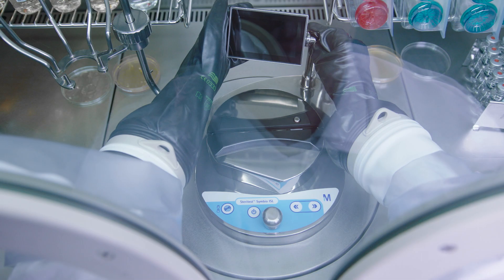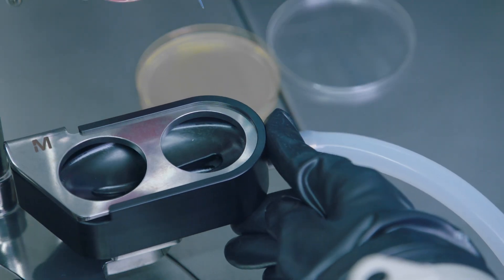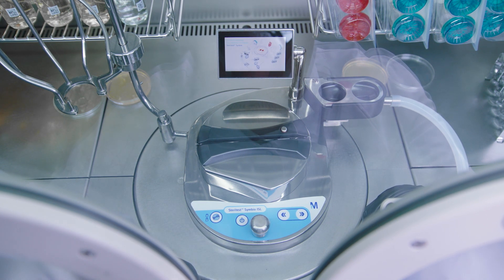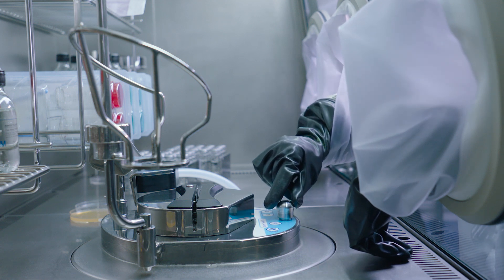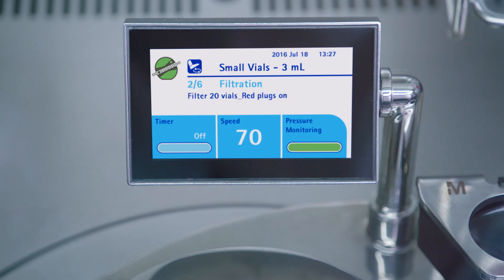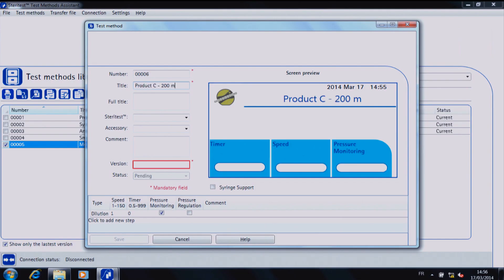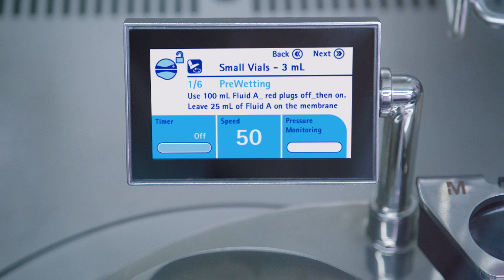The Steritest pump head cover, drain tray, and bottle holder are installed. The Steritest Symbio pump is designed to maximize safety and confidence while streamlining workflow. Its compact design preserves loading volume and testing space in the isolator. The pump's test method mode ensures test reproducibility through step-by-step operator assistance. Test methods are easily created and transferred with user-friendly Steritest Symbio PC software. The pump displays valuable information, such as which Steritest device is suitable for this assay, and speed is automatically adjusted to save time.